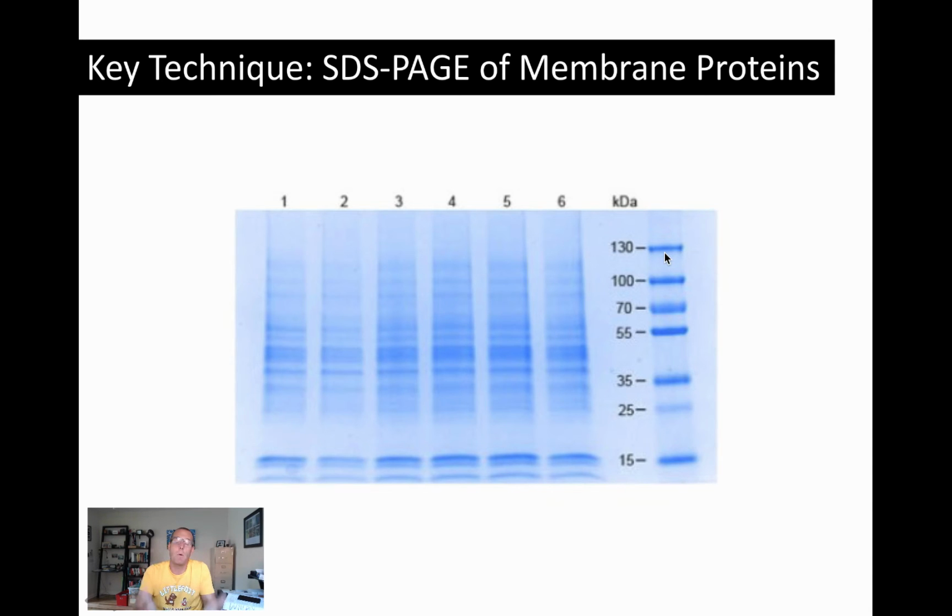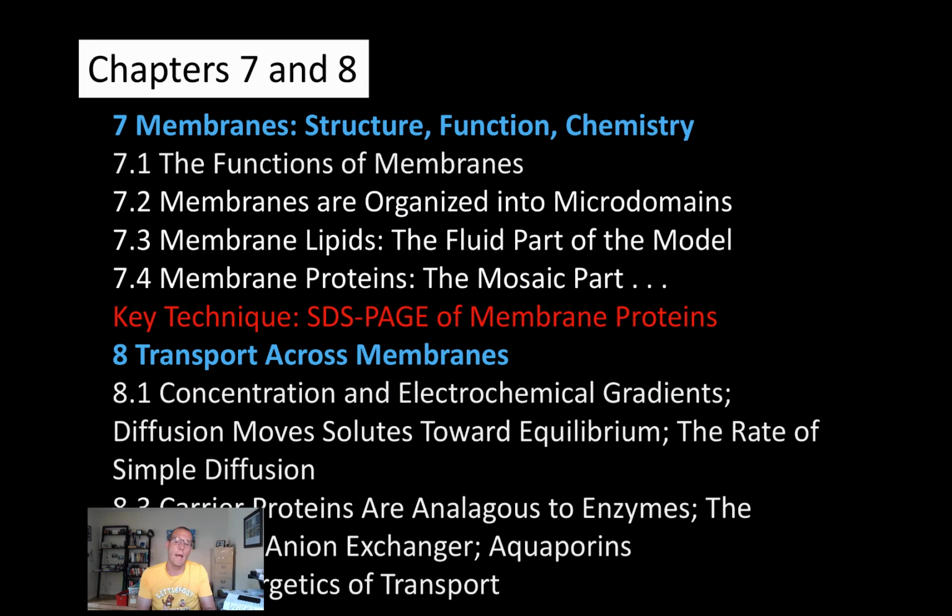So that's SDS-PAGE. It's a technique for separating proteins, and then we can use these separated proteins to do numerous other techniques, and those techniques will come up a little bit later in the semester. So that's it, just a quick technique for looking at a way to separate proteins in complex samples and visualize them.